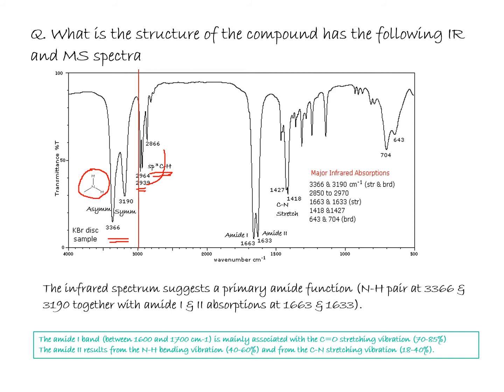And in the area of 1663 and 1633, we have 2 peaks for amide.